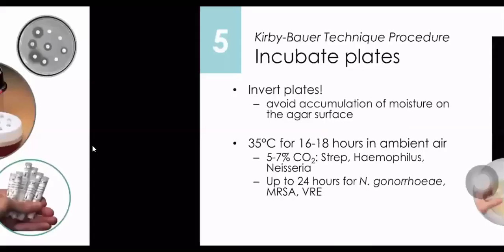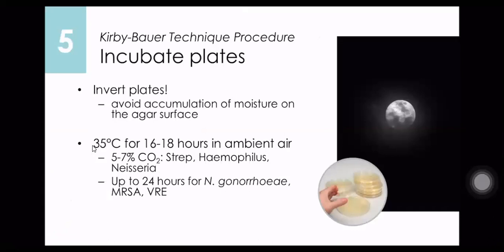Okay, so next is to invert the plates when you are incubating the agar plates, because this is to avoid accumulation of moisture on the agar surface. Because if there is moisture on the agar surface, or on the agar with the inoculum, there is false resistance due to heavy inoculum.